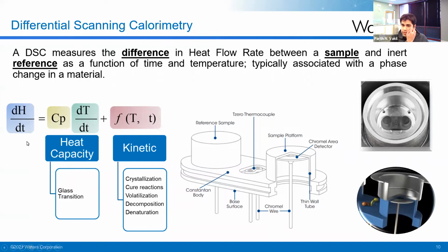When we think about the heat flow, you can think of it as being comprised of the thermodynamic component as well as the kinetic component of the properties of the material. And the instrument can give you insights into things like the glass transition, crystallization, level of cure, any denaturation or decomposition that is associated with a heat-based signal. And a heat-based signal is universal.